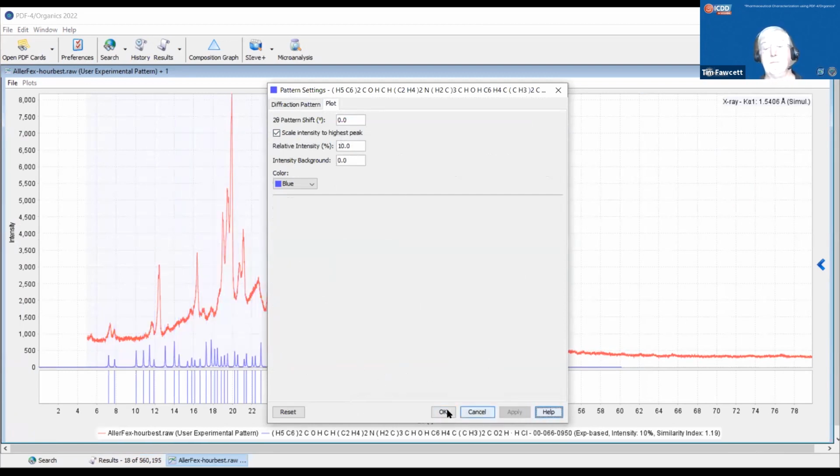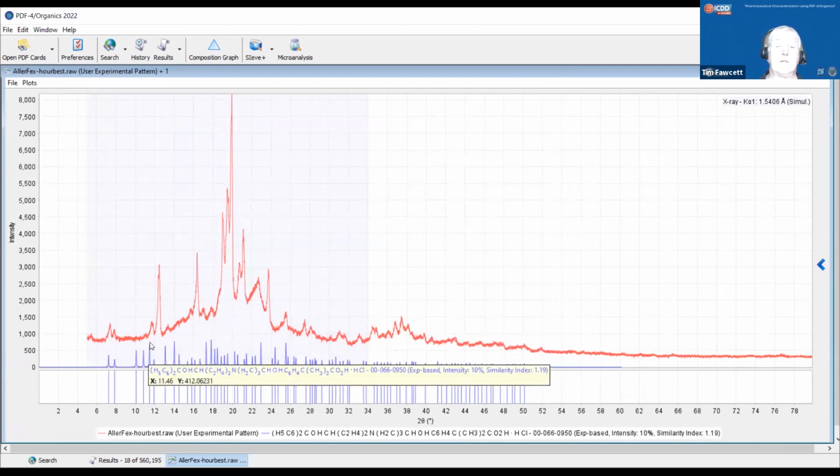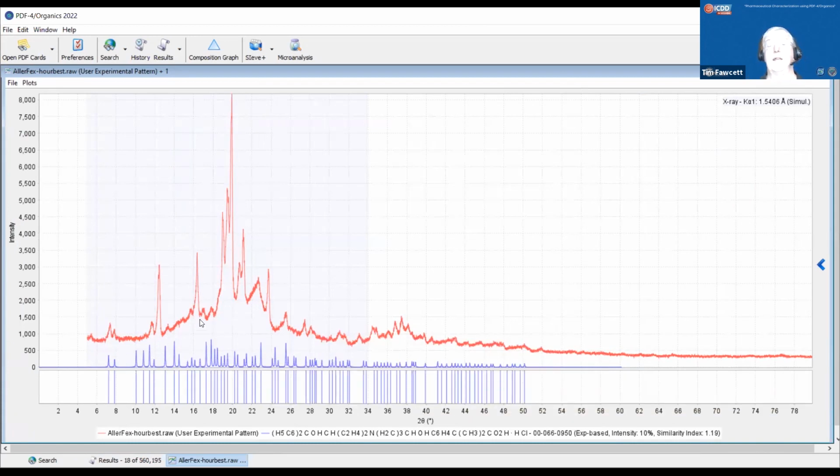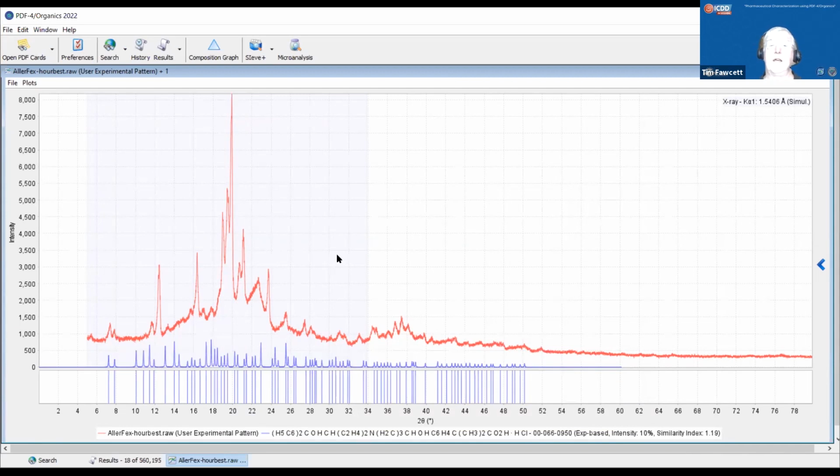I'm going to apply it. And then I say, well, we've got the 2 peaks here, a major peak here, a major peak here, which would mean that this might be a candidate for what's in this particular drug. Now, I would never do it based on this quick analysis, but this quick analysis could say, of those 18 things I was looking at, which one is the most important? Which is the one that I should focus on? And it's telling me this is the one I should focus on.